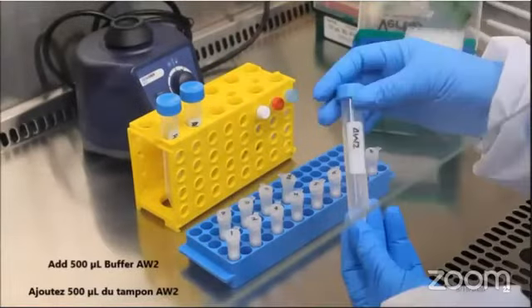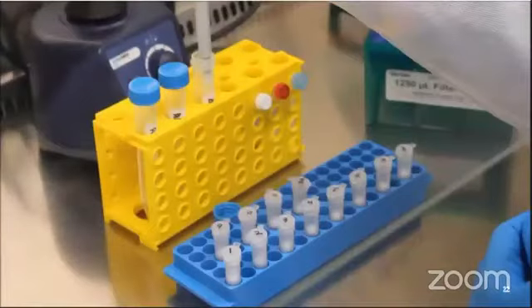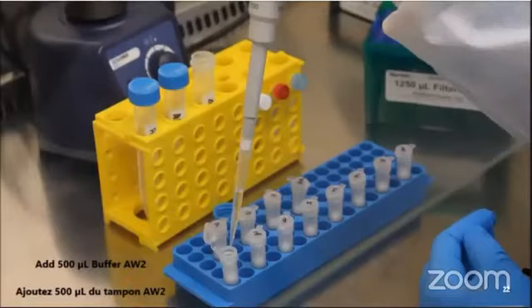Now the wash buffer 2, which is the AW2, and the addition of AW2 onto the column.